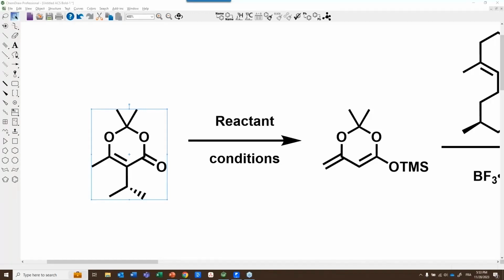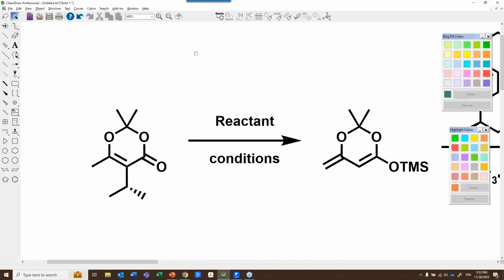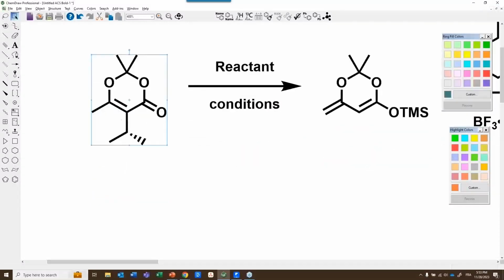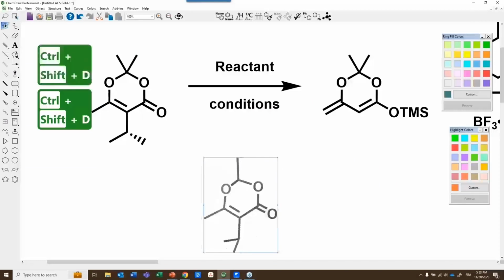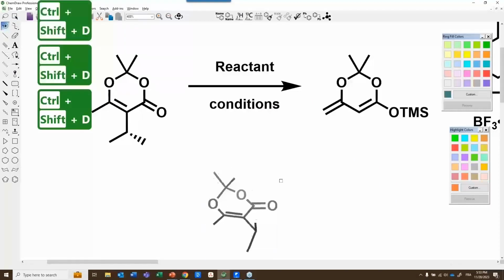Can you please explain once again how to convert a 3D structure from ChemDraw into PowerPoint? So for this, the prerequisite is that you need to be on ChemOffice. ChemOffice is the highest level of ChemDraw, and only ChemOffice has the 3D to 3MF object. But once you do, you take a molecule in ChemDraw, and you make a 3D conformer out of it, Control-Shift-D, like this, for example.